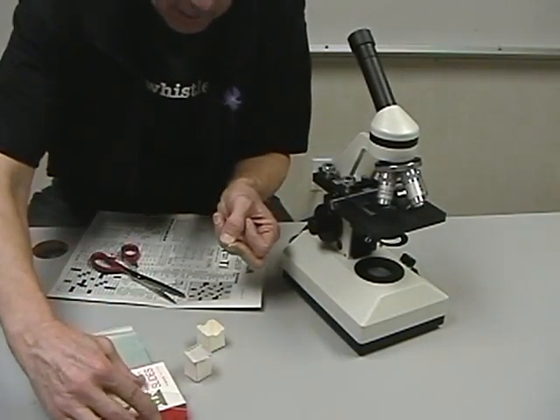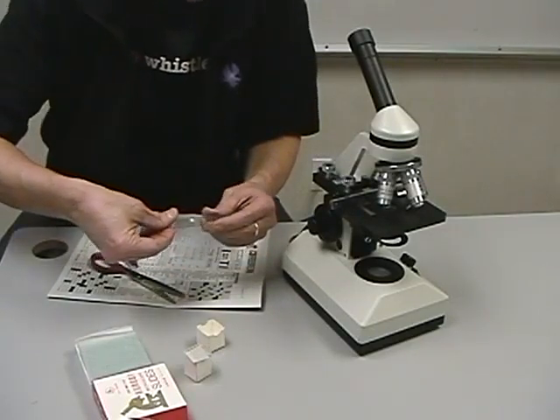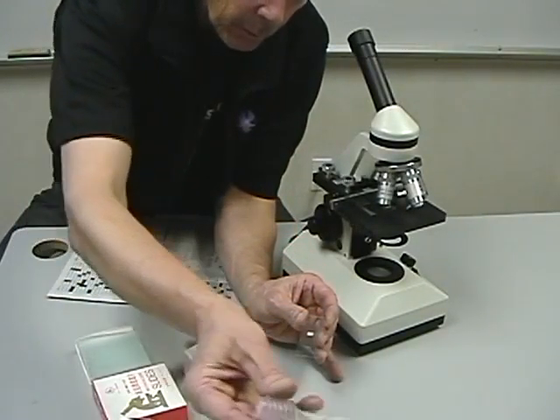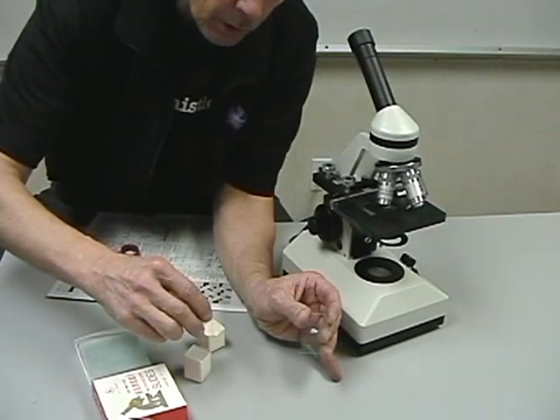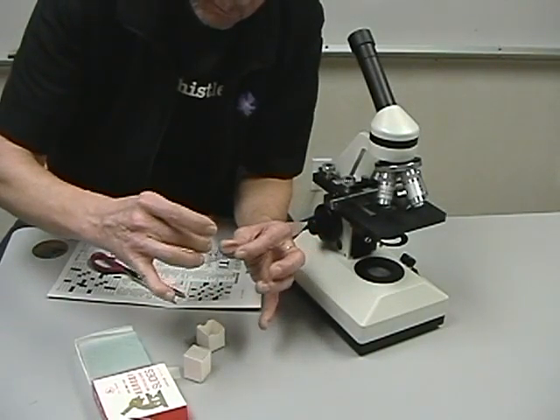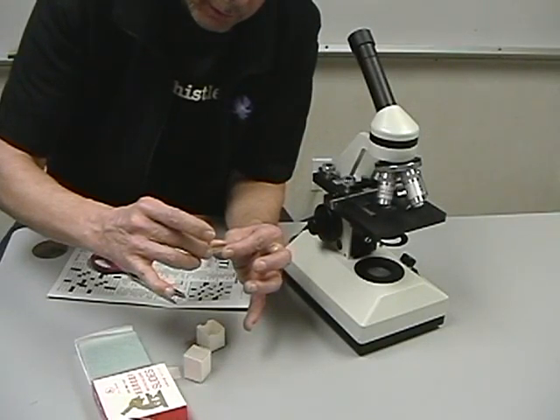Then I take my glass slide, place it right on top of it, and with my eyedropper, I put a drop of water right on top. There we go, perfect. And with my cover slip, I approach it at a 45 degree angle, and then I just let it drop. 45 degree angle, as soon as it touches the water, let it drop.